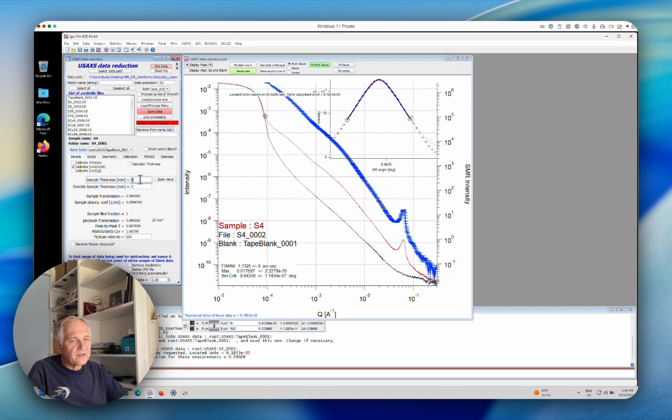So when you're collecting data, you need to provide an appropriate thickness. Typically, that would be anywhere between 50 to 100 micrometers for foils, metallic foils, and other things, to millimeters for polymers and other things, and then maybe up to 4 millimeters for NMR tubes, because our instrument typically operates at 21 to 24 kiloelectron volts, so we have high penetration capabilities.